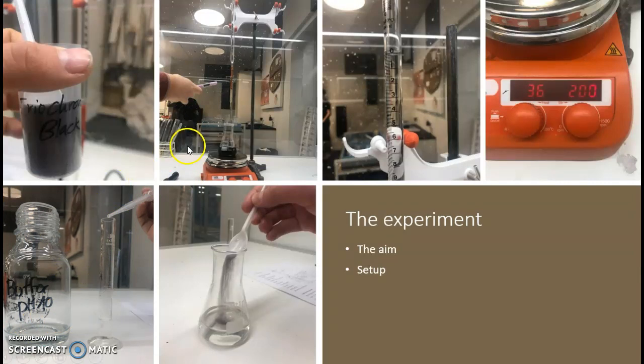We use that to make the water have the perfect pH value to react. We also heated up both the boiled water and the tap water to make the temperature alike, so the reaction wouldn't depend on the temperature.